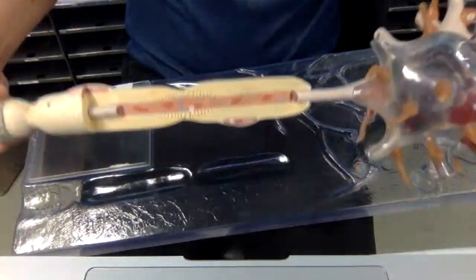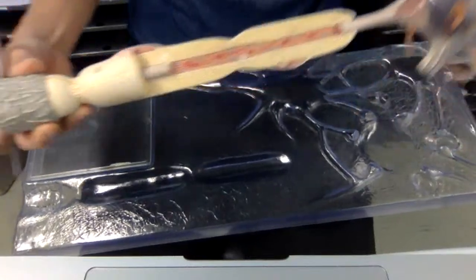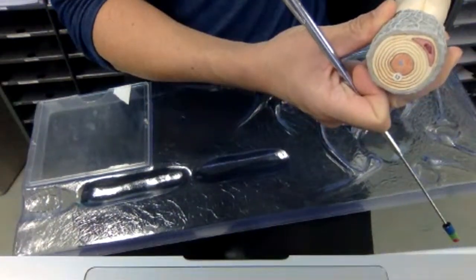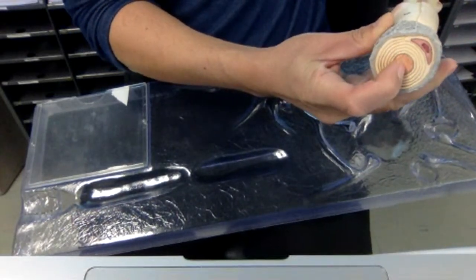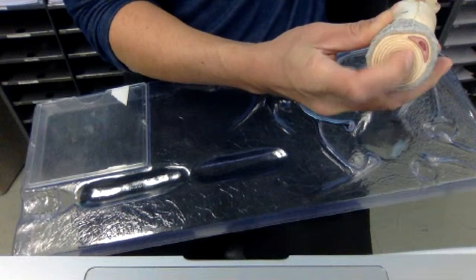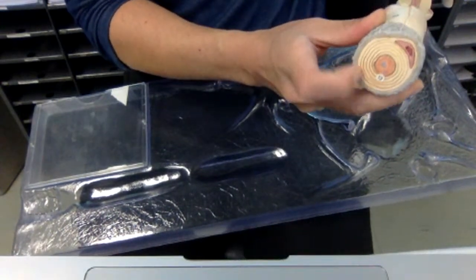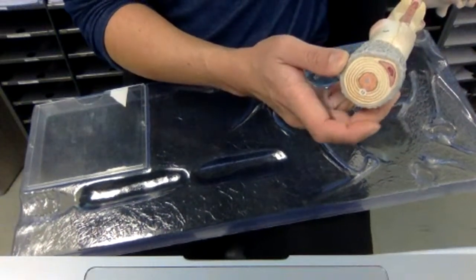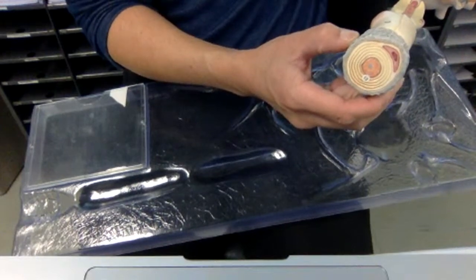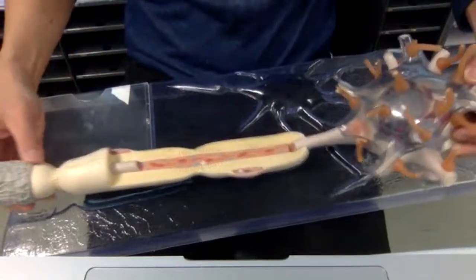I just want to reiterate, you can look at this cell from a longitudinal cut. You can look at it from a cross-section cut. You can see the axon in the middle. You can see the myelin wrapping around. This sheath covering the outside, that's covering the myelin, is called endoneurium. Remember we went over endomysium, which covers individual muscle fibers? This is endoneurium. I'll type that out.